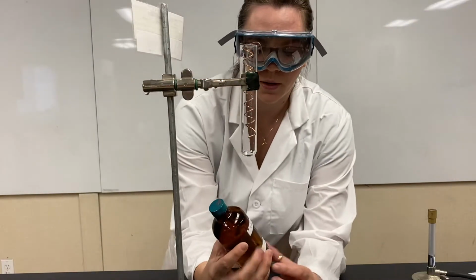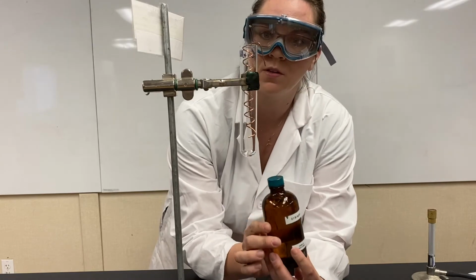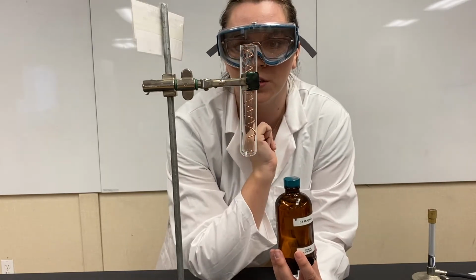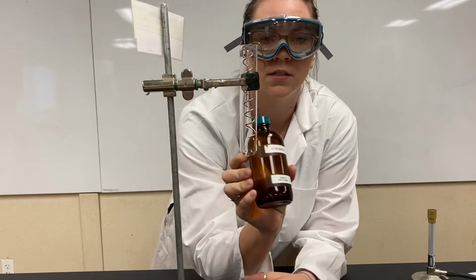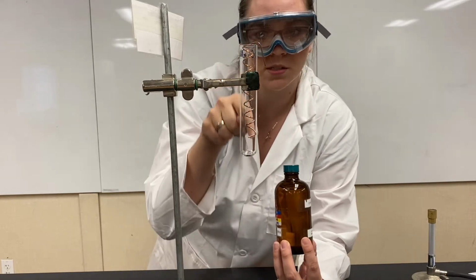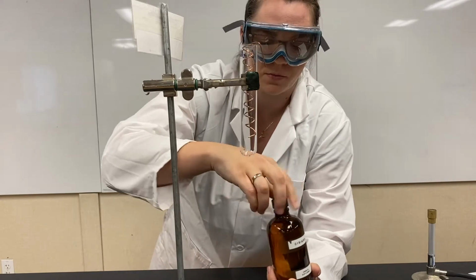All right, we are now getting into single replacement reactions, okay? So we have this nice copper wire that's twisted in a little curly Q. Okay, so we have copper wire plus silver nitrate in this beautiful bottle, okay? So I'm gonna pour silver nitrate into the test tube with copper wire. I'm gonna watch what's gonna happen.